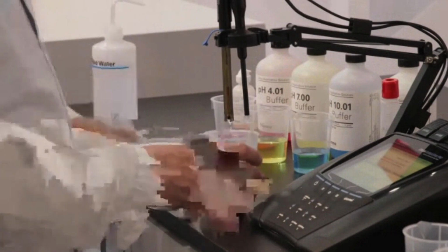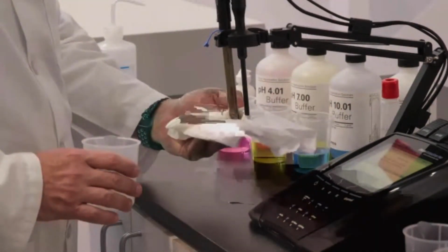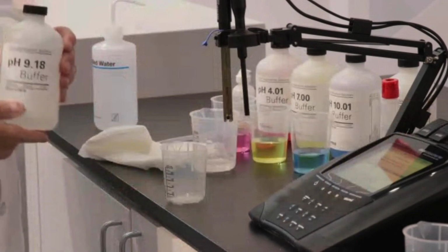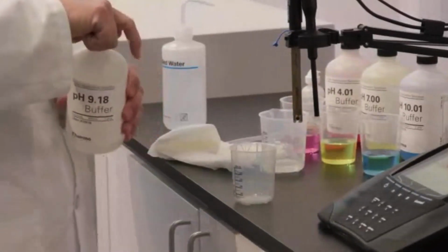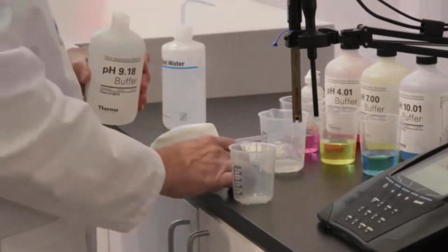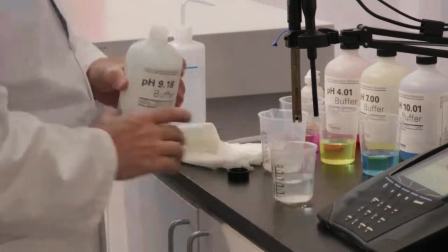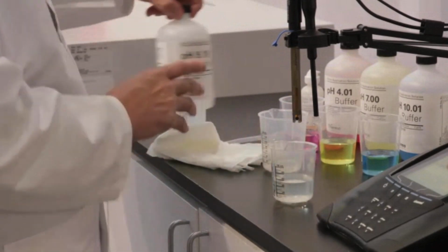Depending on your quality assurance procedures, you may want to run a calibration verification, or you may be required to do that. So what we can do is use a pH buffer like 9.18, a buffer that we have not calibrated with, and we can read that buffer and verify that it reads as expected.